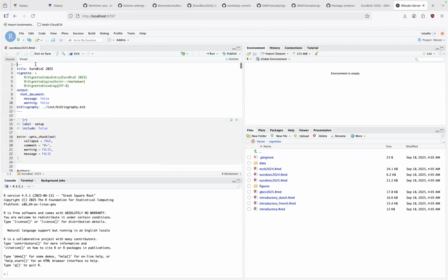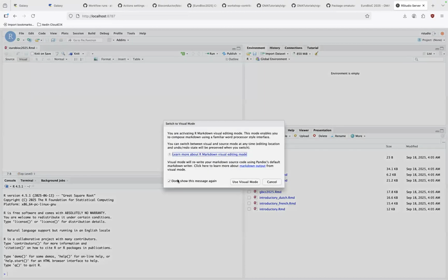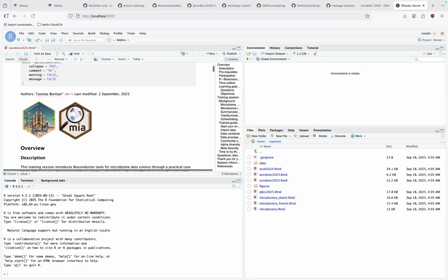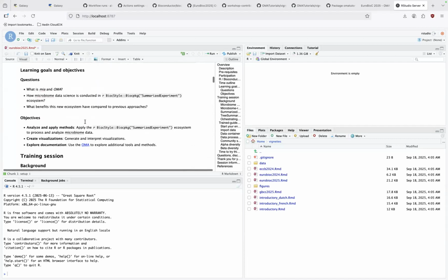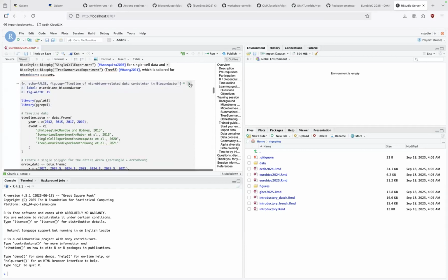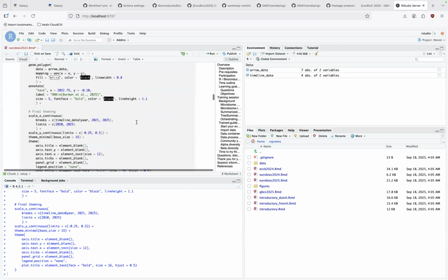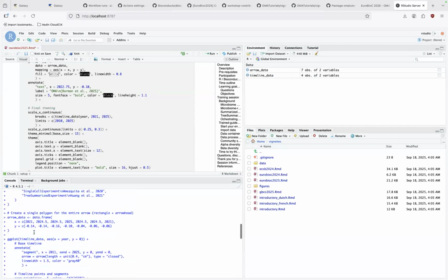So if I go to this one, for example, here you can also do the visual mode. Visual mode, okay. More rendered, and you'll see the actual pictures here. So it's a little bit closer to the GitHub pages version that I showed earlier, but it is still runnable. If we scroll down to where the actual code is, there's, for example, this little play button, and that would be how you can run through the material just by going through it without typing anything. And you'll see in the console down here, it just ran through the code that I pressed play on.